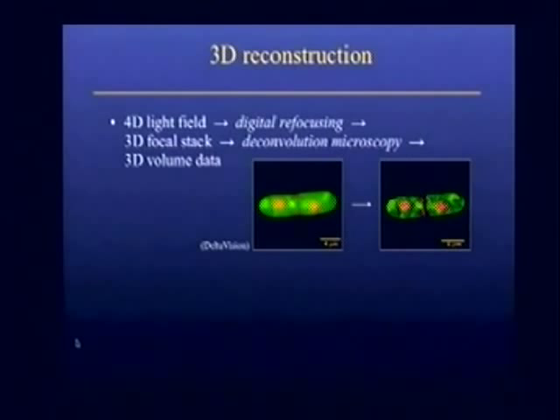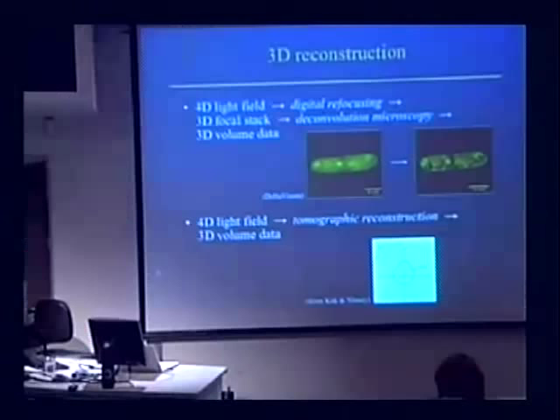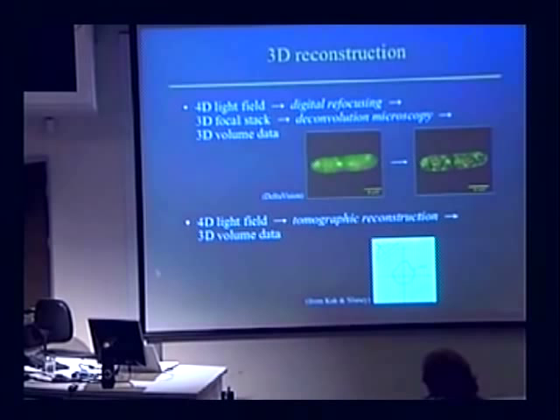Right. So it turns out, and we have a proof in a recent paper, that digital focusing followed by deconvolution is mathematically equivalent to limited angle tomography. It's interesting, these two solution techniques developed in different fields, tomography in medical imaging and deconvolution microscopy in biology, but they're exactly the same mathematical technique, and the two sides haven't really been talking to each other. So know where your data comes from.